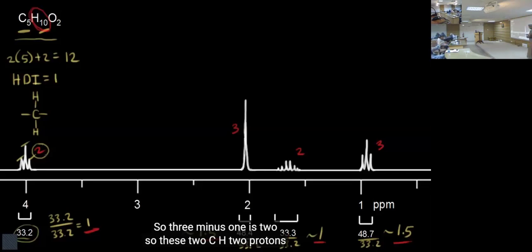Okay, second one now. Okay, Honey, can you please explain to all of us how you came up with either of these or both of these structures? We are waiting. How do you know? The difference in chemical shift of CH3 attached to carbonyl.